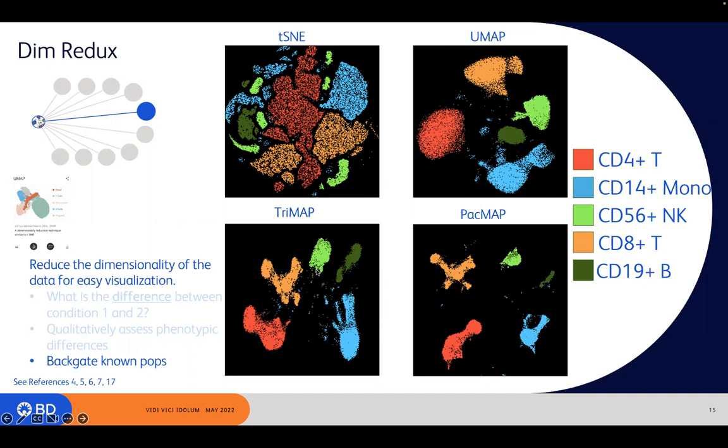Now, I recommend that most people, when they use UMAP or any of these others that have the map suffix, you'll notice that they have these peninsular projections coming off some of these blobs. And these peninsular projections are nice in that they give you the idea that there's a group of cells that belongs to this much larger body. They're highly related to this much larger body, but these cells are breaking off because they have a marker or two that are changing. And so a lot of times you can infer trajectory or development, let's say, of a particular cell type moving along some sort of trajectory, and it's easier to see in these map type projections.